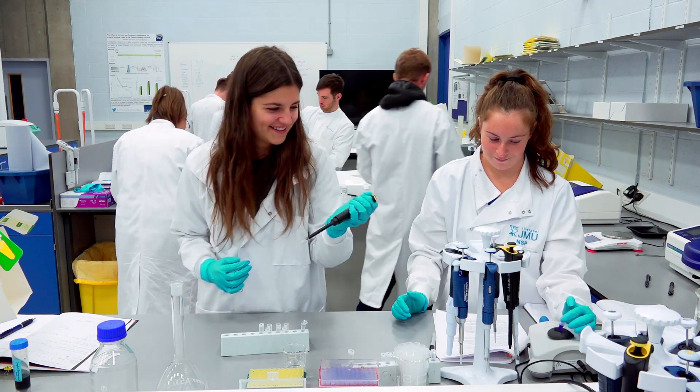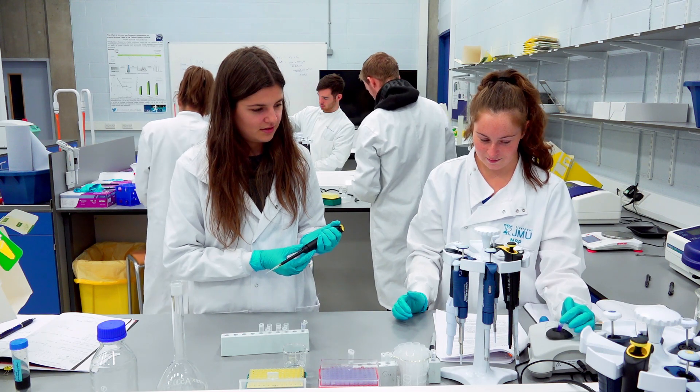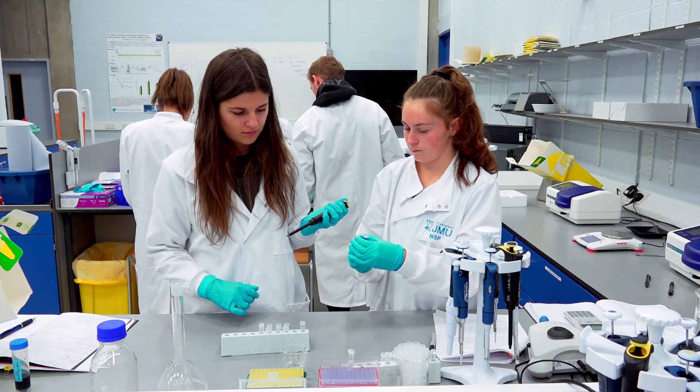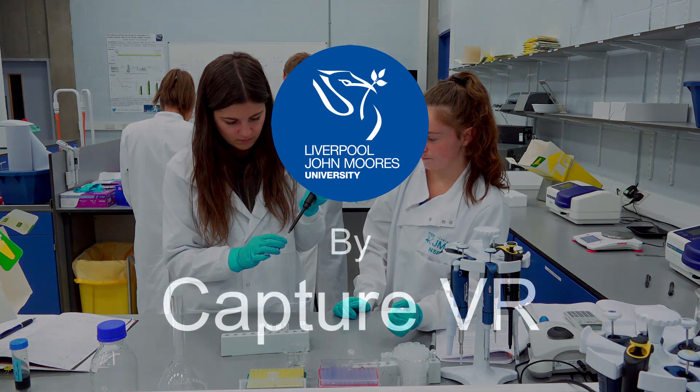Using this technique we can create a set of standards that span a range of concentrations that we're interested in, and each step should be exactly half of the previous one.